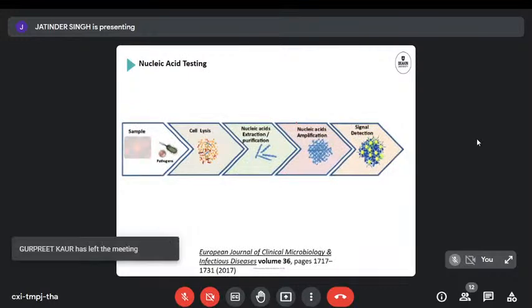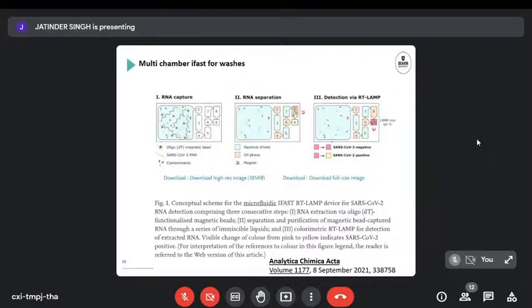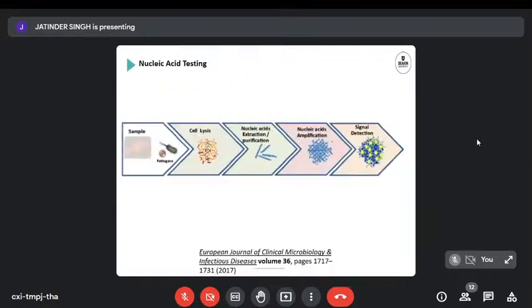So cleanup, whereas with a lot of the articles, it started off where only the amplification was being done on chip, and all the sample preparation was done with kits on the bench before injecting into the fluidic device. There is a growing number of options to actually do on-chip lysis and DNA extraction. Keeping in mind that sometimes solutions like these are being used where there's a very large sample chamber in order to collect as much DNA as you can to ensure that there will be sufficient copy numbers so that someone that's sick actually gets a positive outcome in the test.